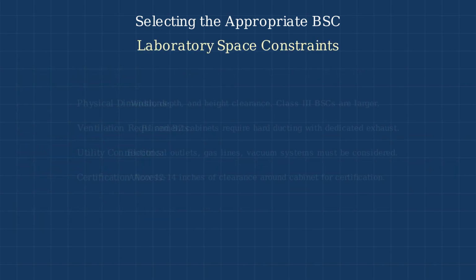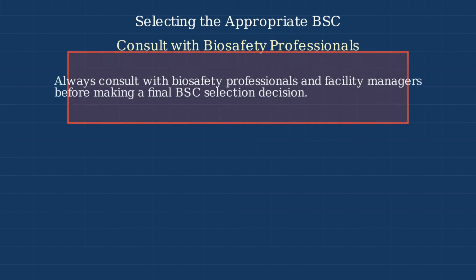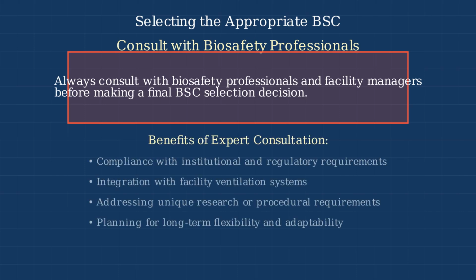Laboratory space constraints are often overlooked but critical in BSC selection. Consider the physical dimensions, ventilation requirements, utility connections, and certification access needs for your chosen cabinet. The final and perhaps most important step in selecting a BSC is to consult with biosafety professionals. Expert consultation ensures compliance with requirements, proper integration with facility ventilation, addressing unique research needs, and planning for future adaptability.